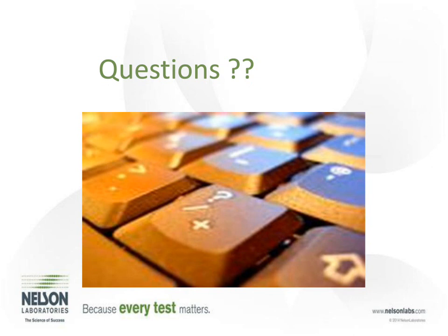Great. Thanks, Thor. Moving on to our next question. What if you cannot submerge the device in the extraction media due to a very large surface area of every component in the device? Another great question. We tend to try to use coupons or representative portions of that device. The FDA just released last year in April their new guidance document, and it gives instructions or considerations when looking at coupons. Basically, a coupon represents the materials and the processing of your device in the same proportions, but it's just small or in a different shape. What we're looking for in these extraction tests is material and processing residuals, so you just represent those. Other things are we don't need a functional device, so we don't need all the internal components or even portions that could represent the whole.